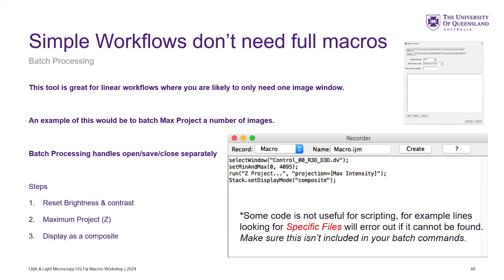Sometimes there is also this tool in Fiji called batch process. Maybe you don't need a full macro — maybe it's as simple as open image, run Z projection, and do that for a whole folder of images. If you open the image, reset the brightness and contrast to max display range 0 to 12-bit, and run projection max displayed as composite — that's not that complicated. You can just use this batch processor. Take these commands and put them in; it handles the folder you're going to look for images in and the folder you want to put them in.